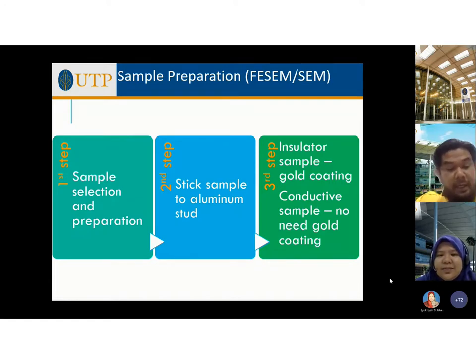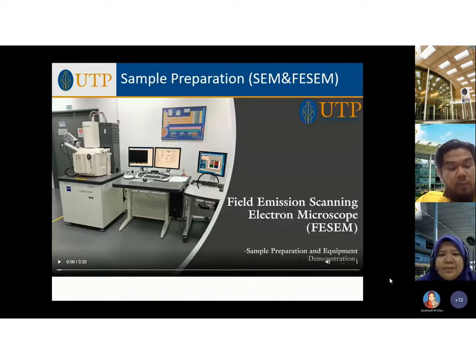For the next slide, there is a video on how to prepare a sample for FESEM. Hope you enjoy it.